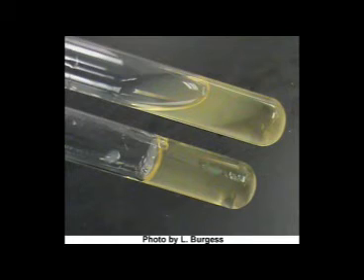The tube at the bottom is negative. No gelatinase was produced, so the gelatin is still present and is able to make the media remain solid.